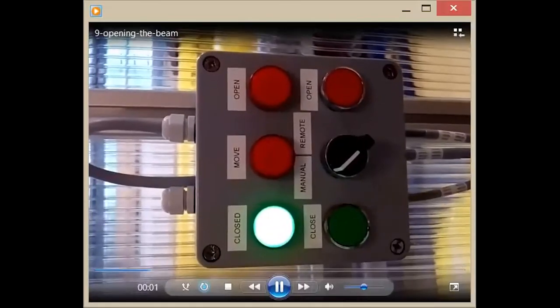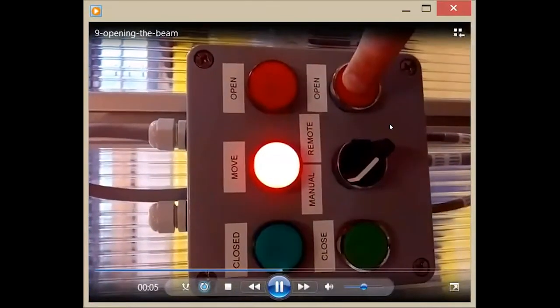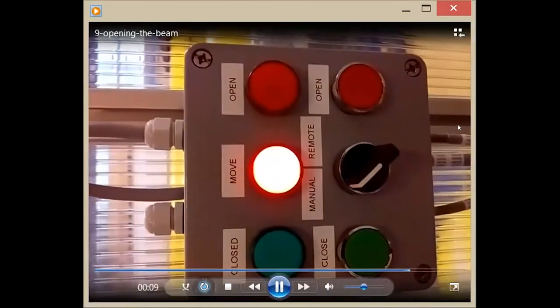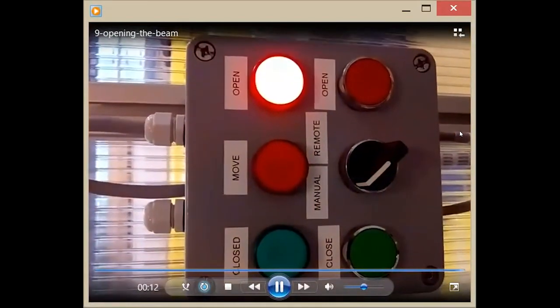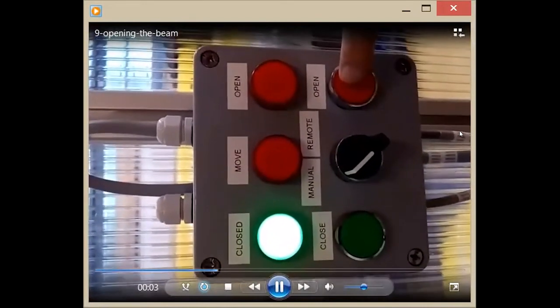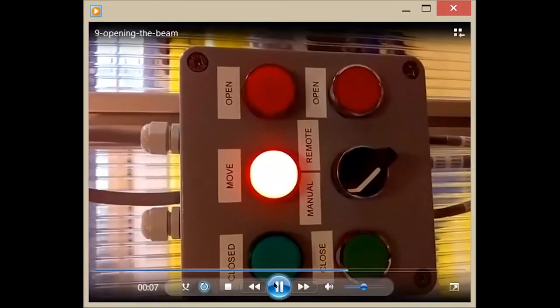So the most important thing is to open the beam. Sometimes we can forget it after the sample manipulation and then launch the measurement very quickly and leave very quickly and not check whether it is working. So this is about it.